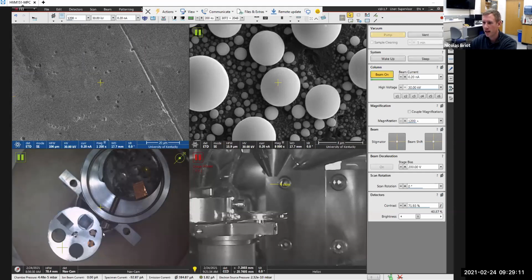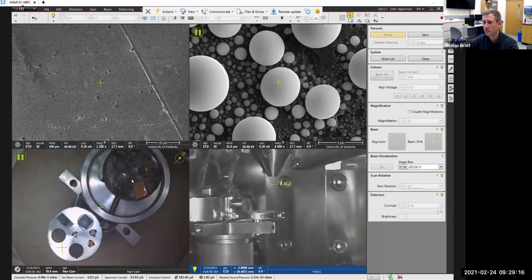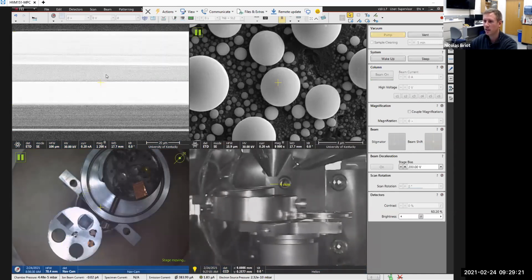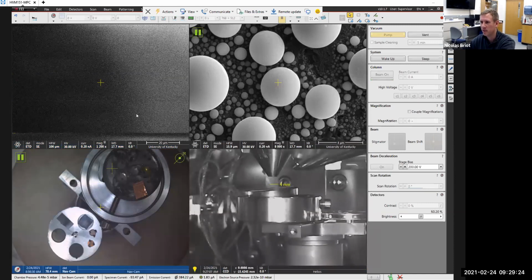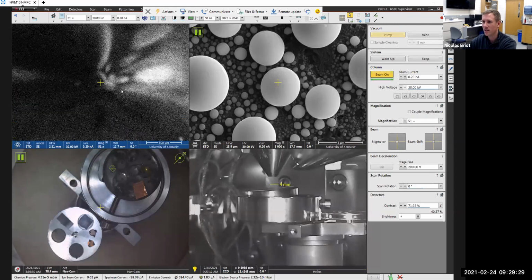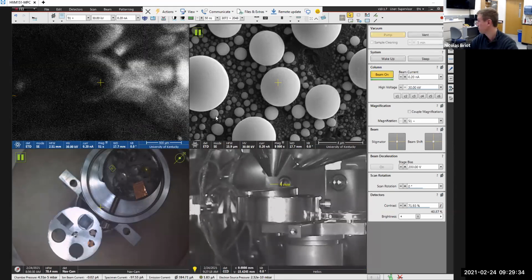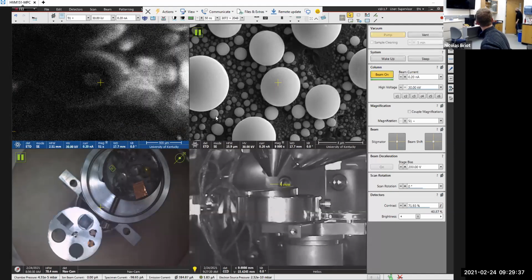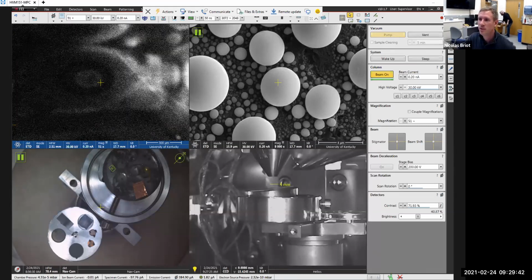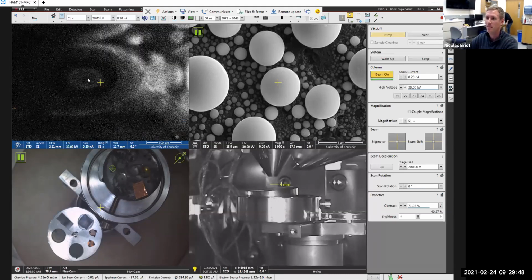Okay? Now, just to compare, I'm going to briefly go on the embedding compound. I don't know if it's acrylic, like it's not bakelite, but whatever you use to embed, and you can start seeing lots of weird things happening. So what you're seeing right now is that you actually see a mirror developing. So I'll take an image of that.